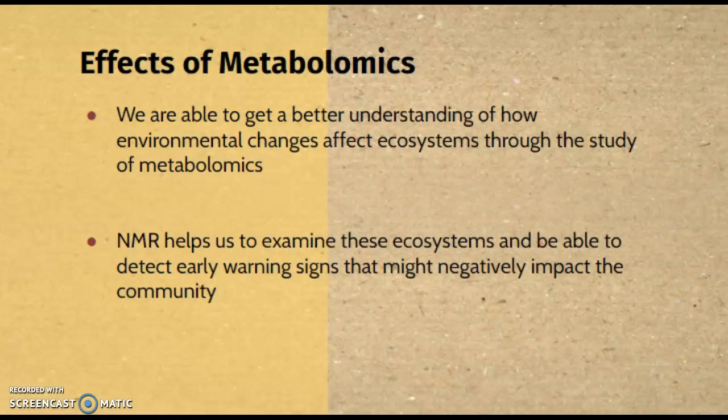Now, this field of study is very significant because with it we can learn more about how changes to our environments can affect our ecosystems, and using NMR has proved to be very helpful because with it we can detect early warning signs that we may not have realized otherwise.